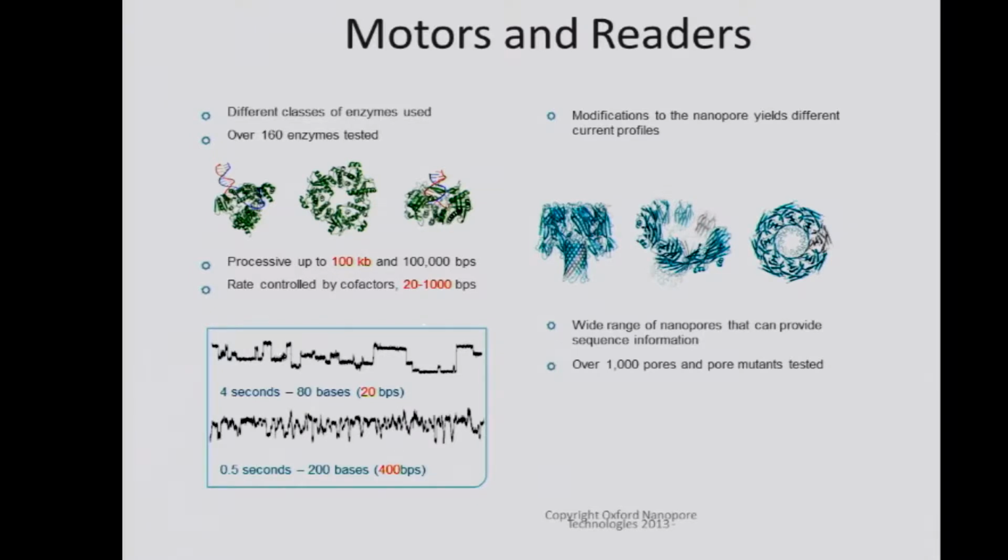The different proteins change how fast the DNA translocates through it, what type of structure, how it passes through, what the processivity is, how many bases can pass through it. The alpha hemolysin is what they decided was the best choice for their initial rollout of this structure. There also are other proteins involved in library preparation, which presumably they also included in their testing for performance of the proteins in this application.